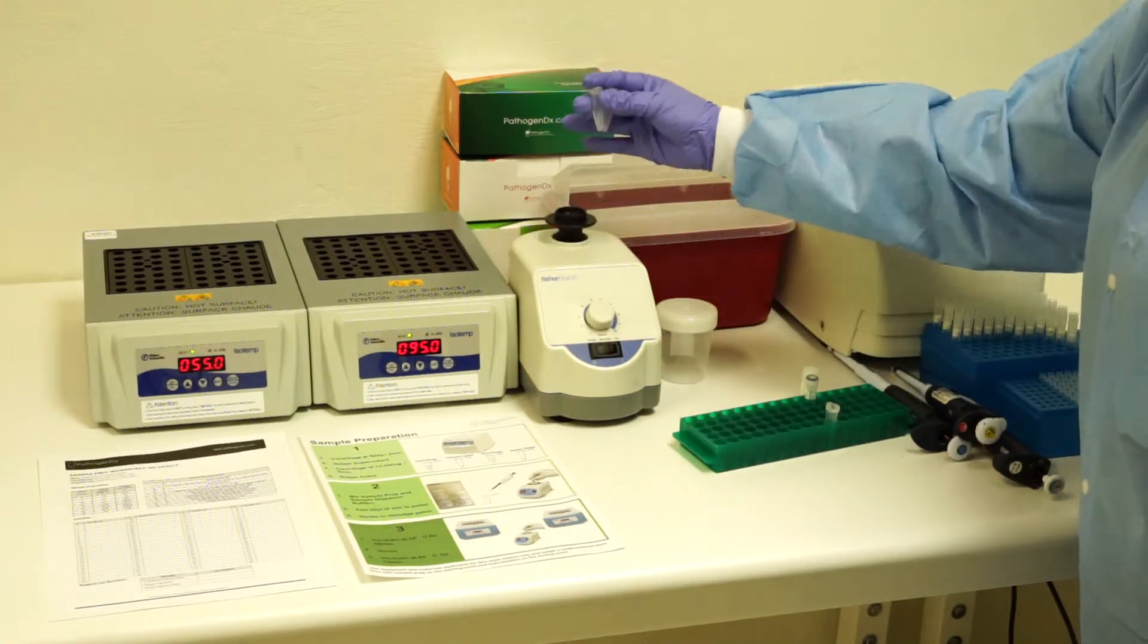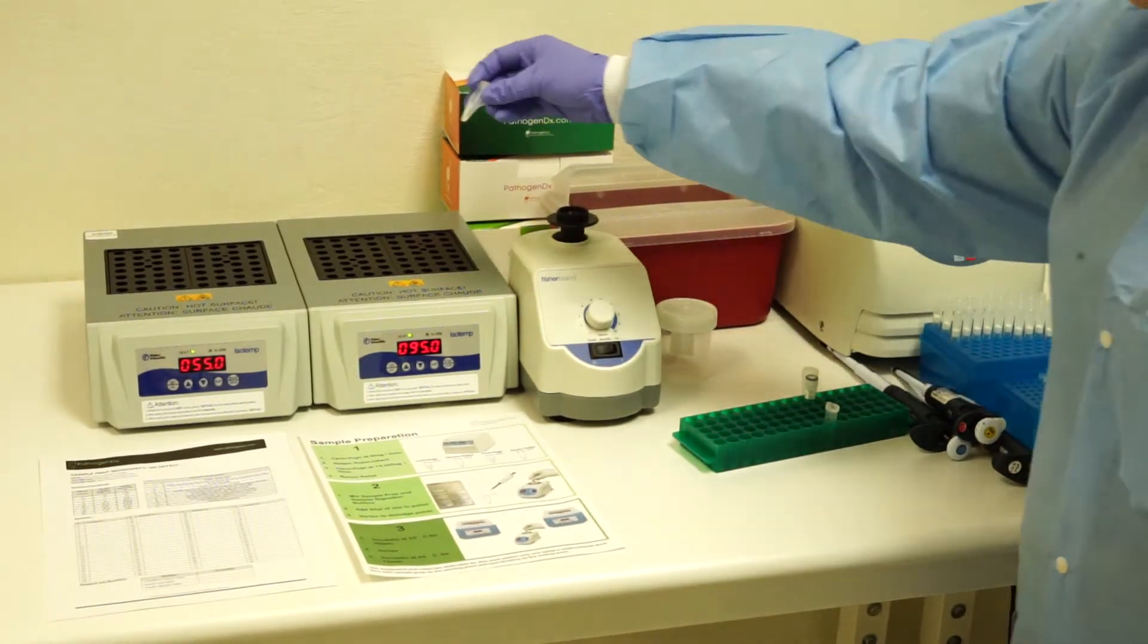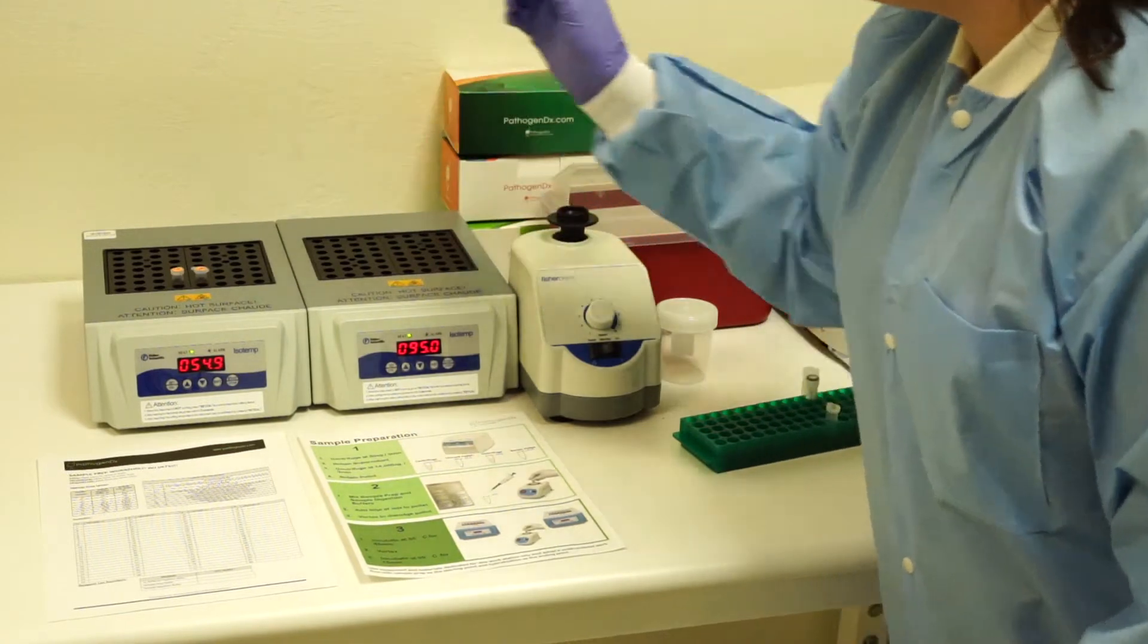Once vortexing is complete and the pellet is dislodged, place the samples at 55 degrees for 45 minutes.